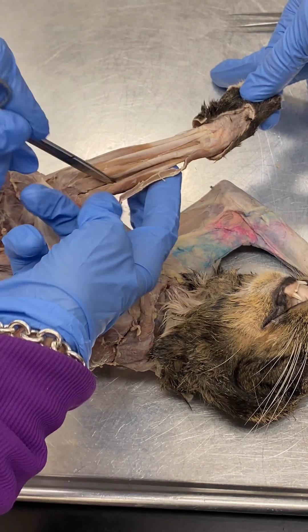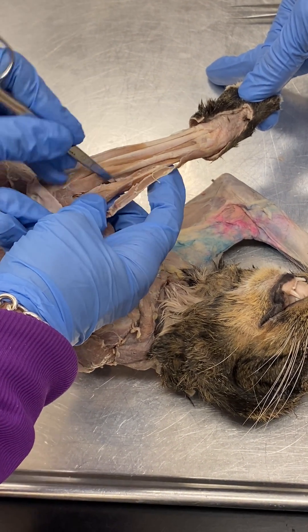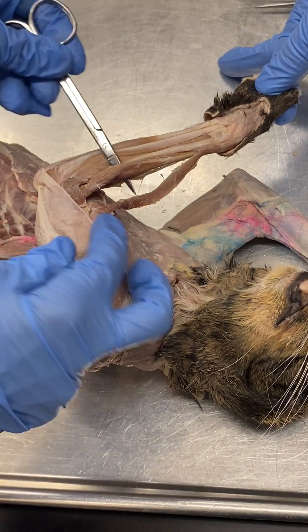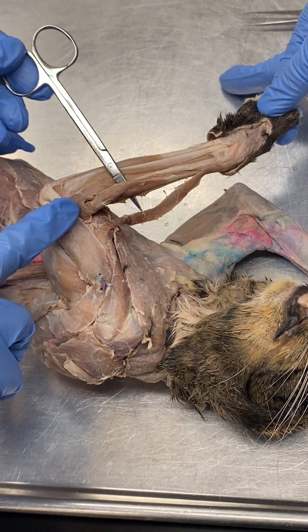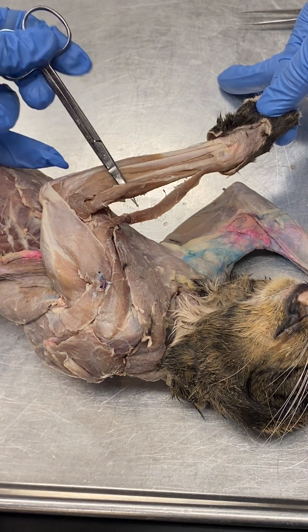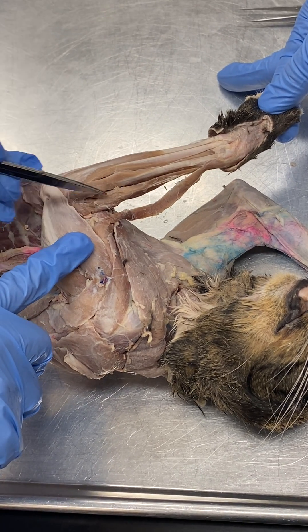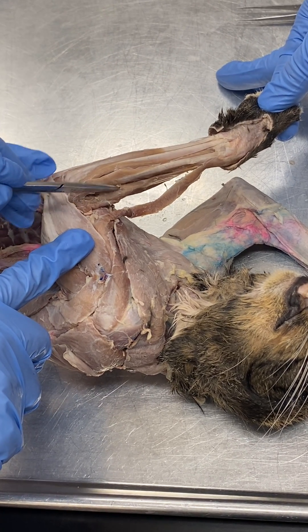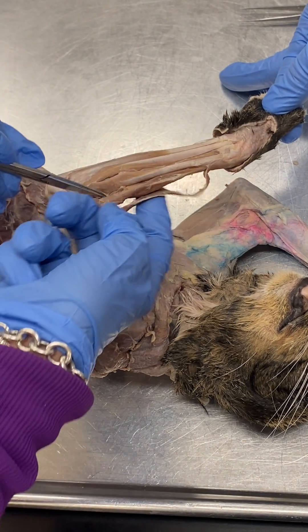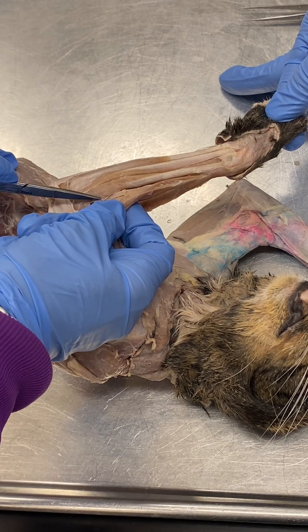The next muscle — in some cats, when they are bigger, and actually in this cat, you might see two bellies if you come closer in lab. This muscle is the extensor carpi radialis longus and extensor carpi radialis brevis. The longus is more lateral and the brevis is more medial, and they are actually fused in this cat. The bigger cats have better definition.